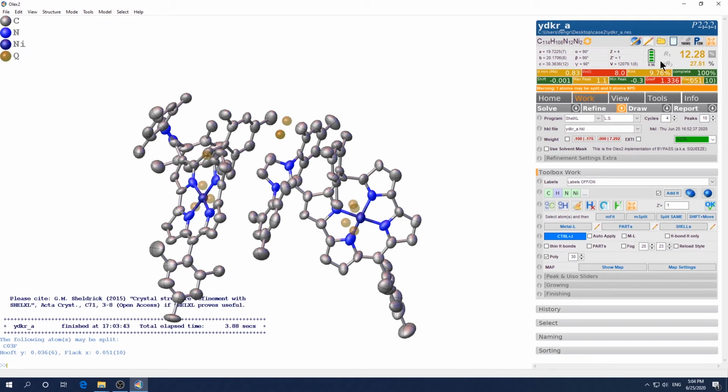So the higher this value, the better. I think the recommended value is 8. So in this case, it's okay. It's close to 10, which is acceptable. The only thing is I'm surprised this data is recently published. Either they have a very bad crystal or their instrument is very old. Whatever it is, this data quality is not acceptable.